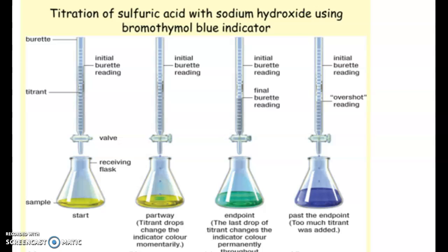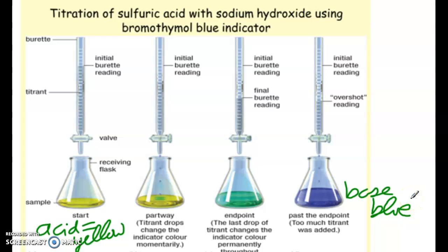So here's an example showing you with the bromothymol blue indicator. If it's in an acid, it's yellow, and if it's in a base, it's blue. So at the neutralization point, the color change is a very, very light green, okay?